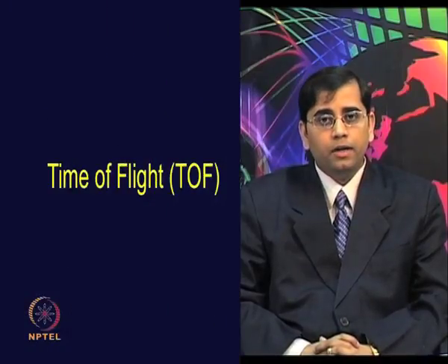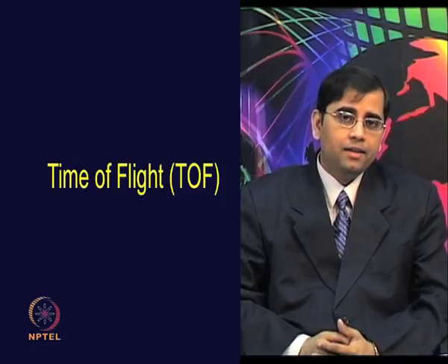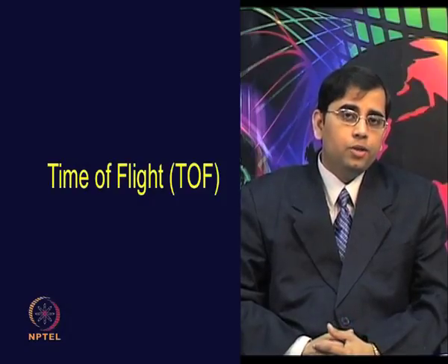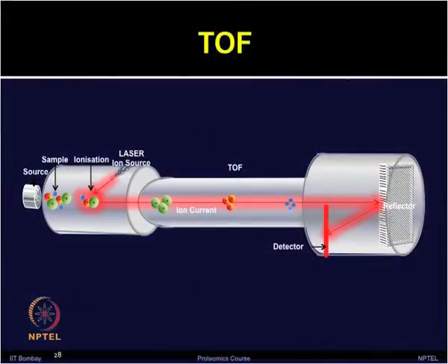First, let us talk about time of flight, which is one of the simplest mass analyzers currently used in combination with MALDI. The TOF has emerged as one of the mainstream techniques for the analysis of biomolecules, and it is widely used for various applications. In TOF, the ions are accelerated to high kinetic energy, and due to their different velocities, they are separated in a flight tube.